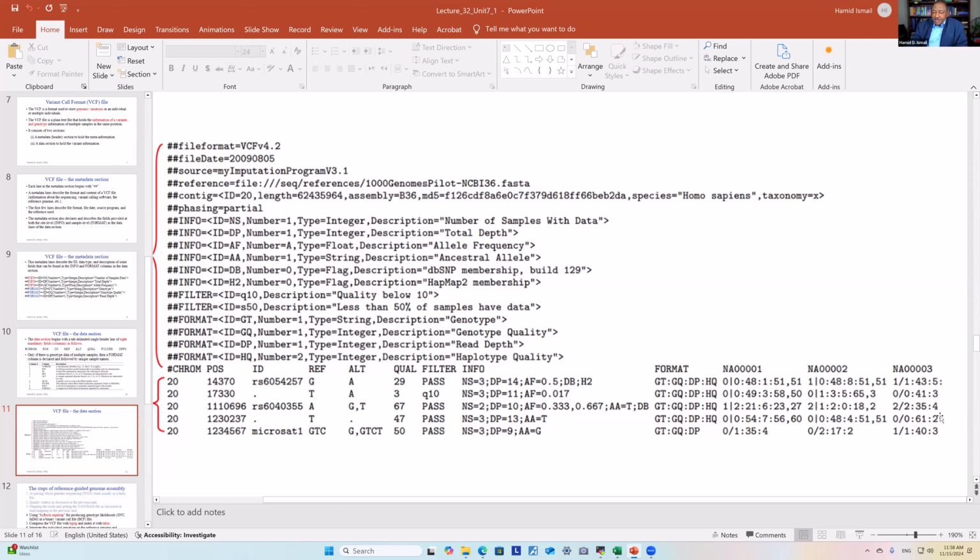But you should understand that you can do any kind of comparison between different samples. Assume that you have 100 samples here. Maybe you need to split your samples into control and not control, and compare between these two groups, maybe three groups at the same time.